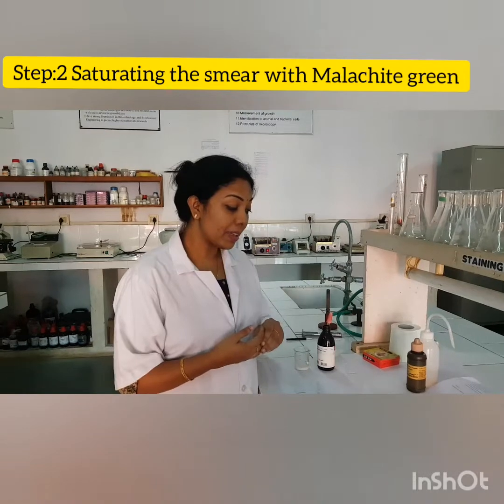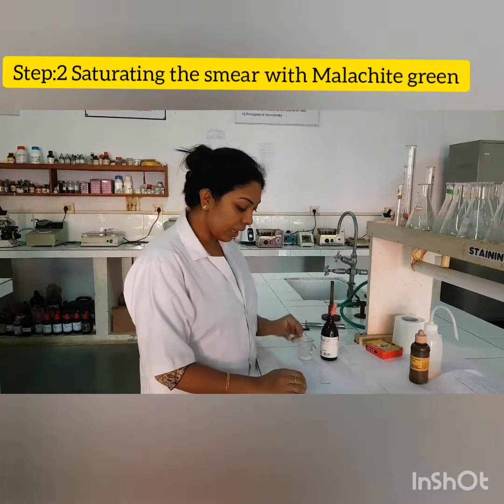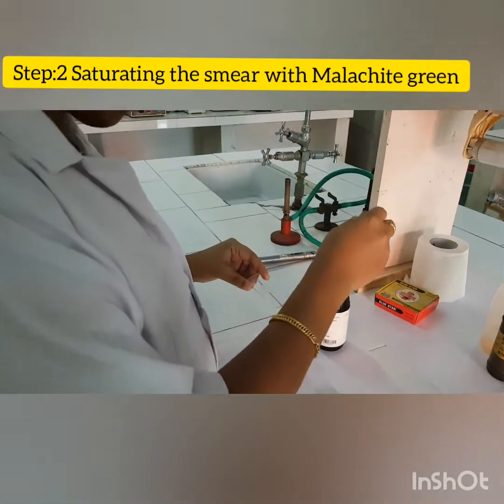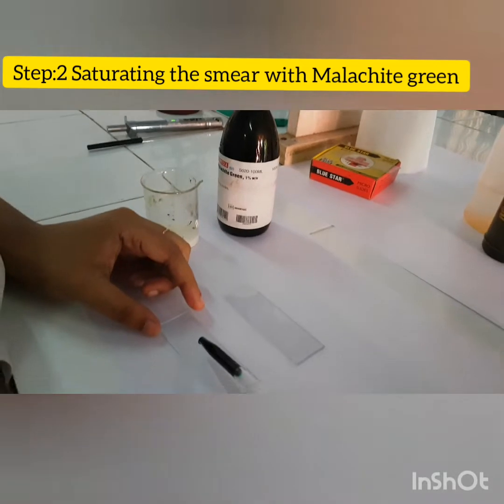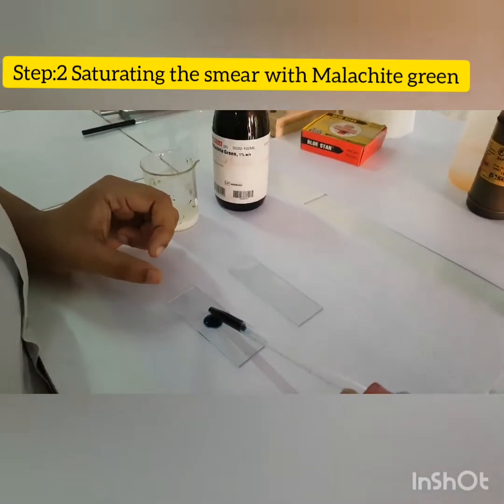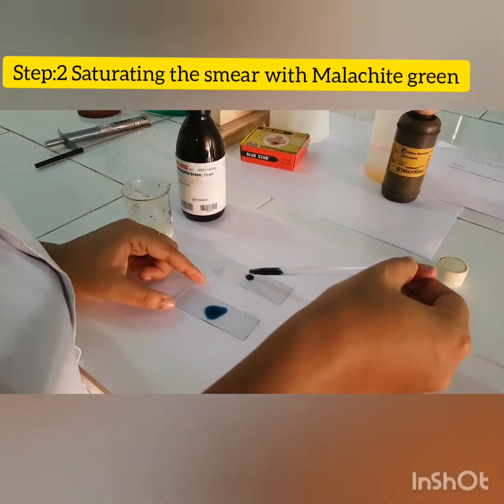The next step in the procedure is we have to saturate the smear with the malachite green. For that, the heat fixed smear is taken and we have to saturate it with malachite green.